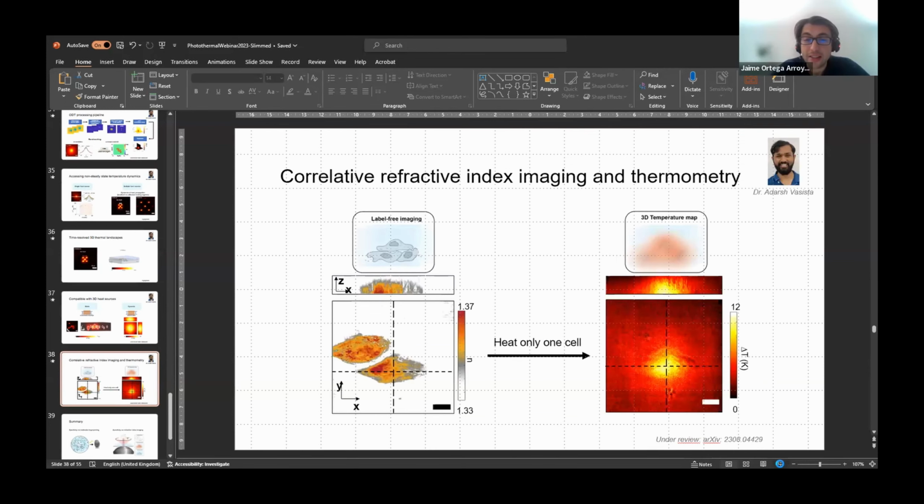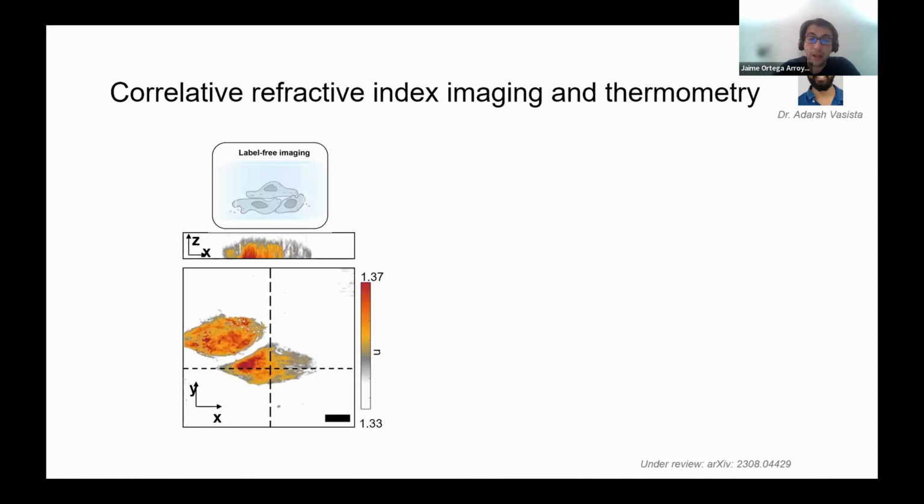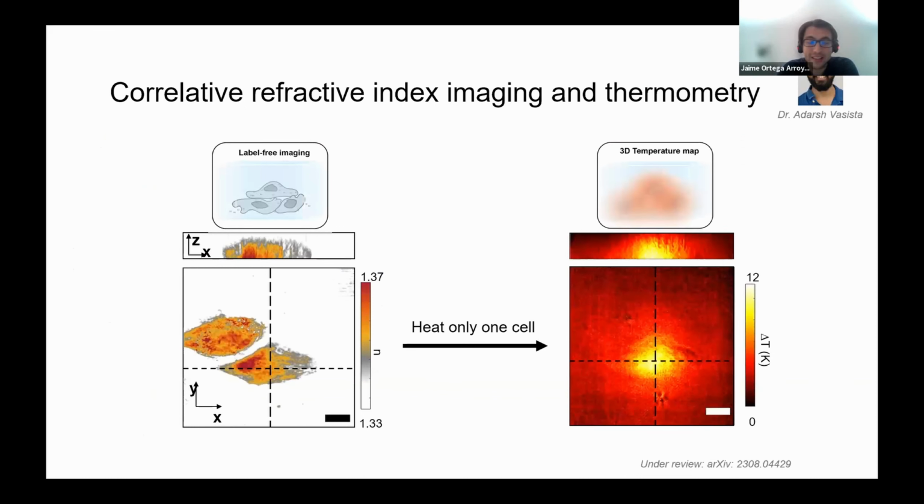So in this case, yes, you're right. There are a lot of things happening with your cell in the cell environment, and in this particular experiment, these cells are fixed. So all the organelles and these things are static. So when we do this pump probe measurement and take the whole tomogram, the only thing that is actually changing is the refractive index environment due to this thing.